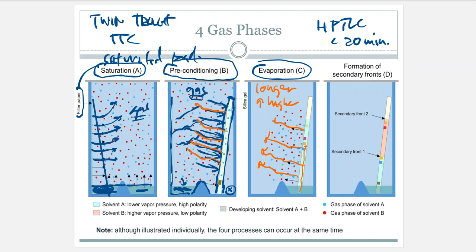I mean, in all situations, for the most part, there's no way that I can speed that reaction up. It is going to take slower and slower time for it to reach the top of the plate as it develops longer and longer. There's things that we can do to help shorten those time lengths down, but it's going to happen. And I just got to accept that, and I just got to go with it.